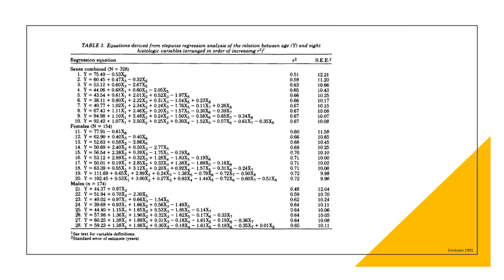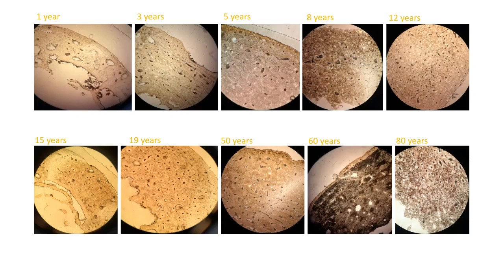For the calculation of the age at death, numerous regression equations exist. They differ based on the skeletal element used, but the majority are applicable to the long bones or ribs. They also differ on the bone characteristics included. Also important to know is that the result is not a number, but an age range, though narrower than one based solely on the macroscopic methods.